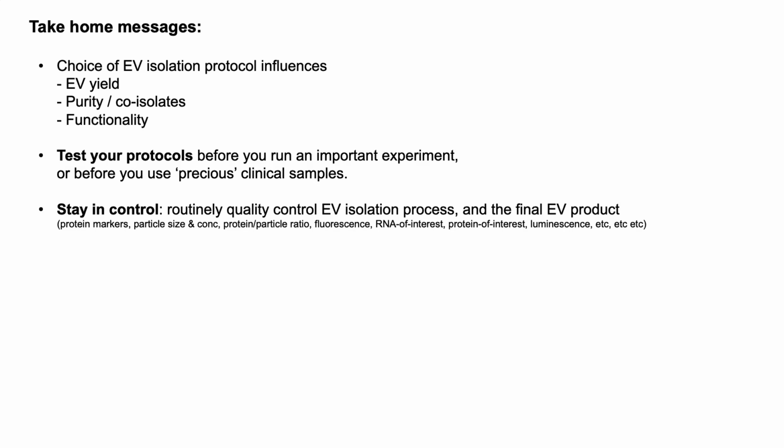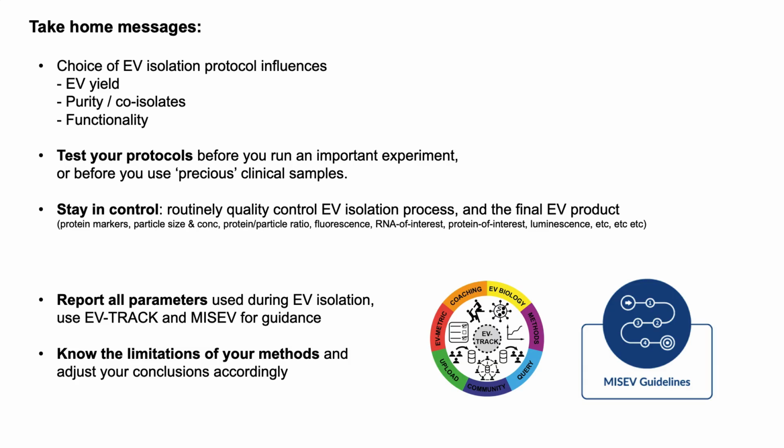Just make sure everything's working as it should. And I would recommend to stay in control of your purification. So throughout the purification process, just do quality control of your EVs, looking at protein markers, particle size, and all other parameters that could be important to you.